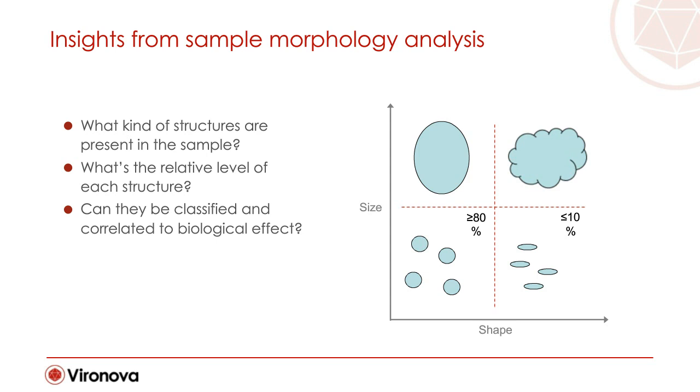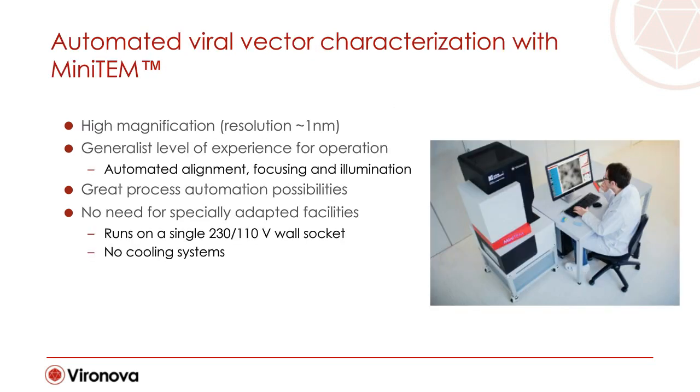Thank you, Josefina and Rita, for this introduction to the setting in which we operate. It's great that so many are attending this webinar, and we're really excited to talk about how we're taking on these analytical challenges. Now, in order to gain the insights we have been discussing so far, we decided to build an automated transmission electron microscopy screening and analytical system so that we can investigate samples with as stable and robust a result as possible.